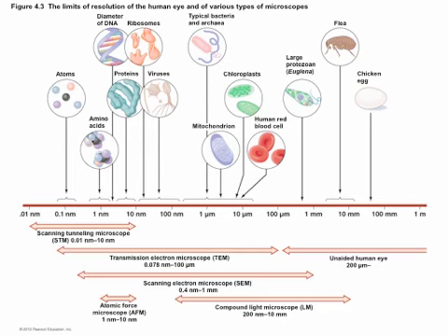And you can't use light to see anything that's smaller than light, or at least not to resolve something that's smaller than light. You can see single molecules if they're fluorescent, but you can't tell where in that half micron area they originate from, because the light itself is that big.